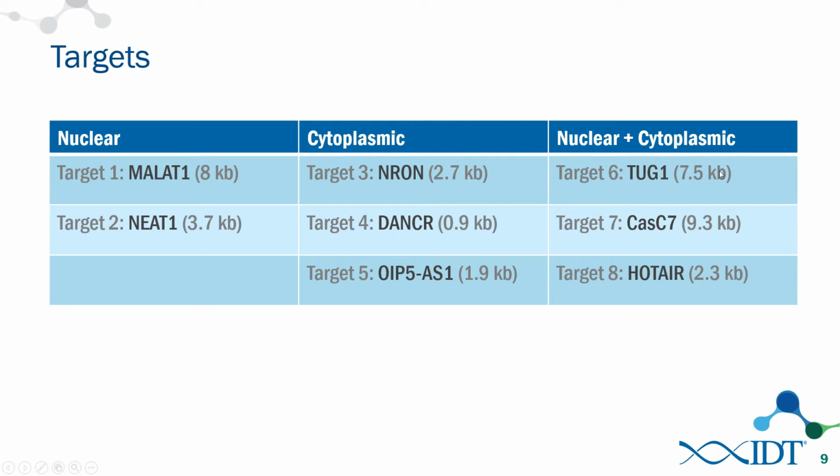Okay. However, saying that, again, we designed qPCR assays at both the 5' end and the 3' end, and for all of the targets studied here, we found they were completely degraded at the time that we took RNA. So while in these cases it didn't seem to matter so much, if you have the longer non-coding RNAs, it could potentially impact that. Okay.